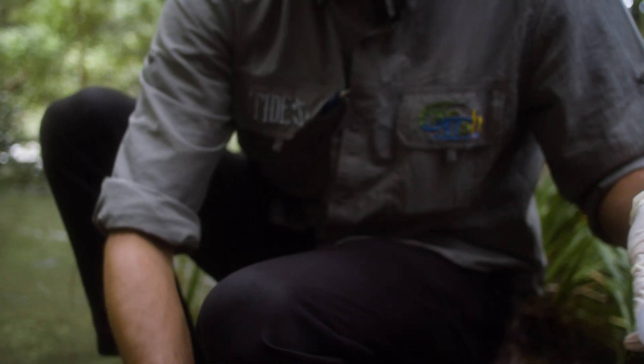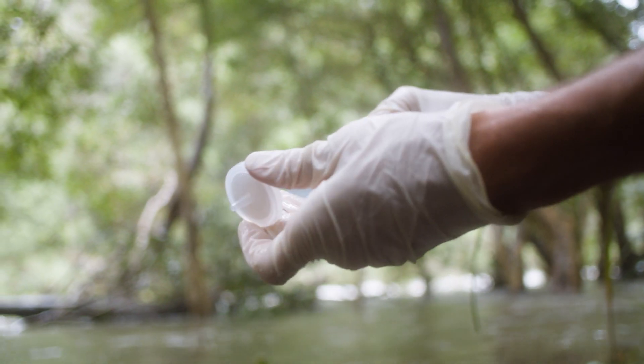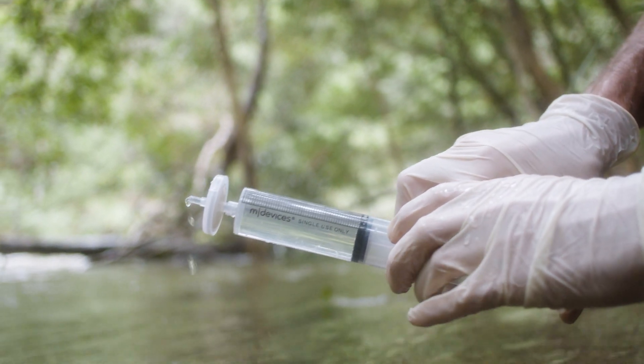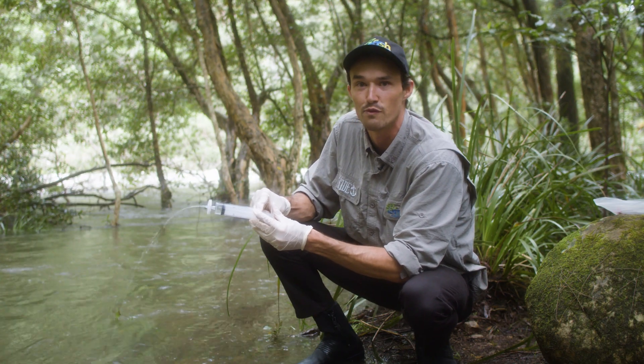Now we just attach the filter to the syringe and force all that water through. We're going to repeat this process as many times as we can until no more water can actually be forced through, making sure we record how many times we do this so we can calculate the total volume that's been filtered.